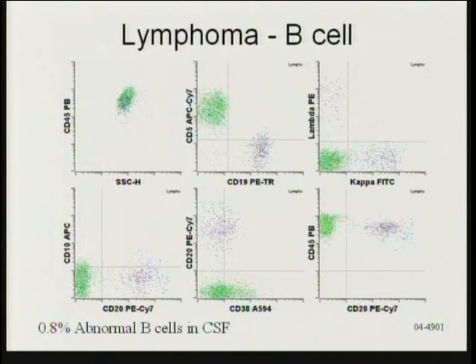So this is at a level that's essentially submorphologic in a very paucicellular specimen, using one tube of reagents and inquiring all the cells that are present. So we're getting down to minimal residual disease levels of detection in paucicellular material. It's an accomplishment. One can also do other things, such as identify plasma cell neoplasms.